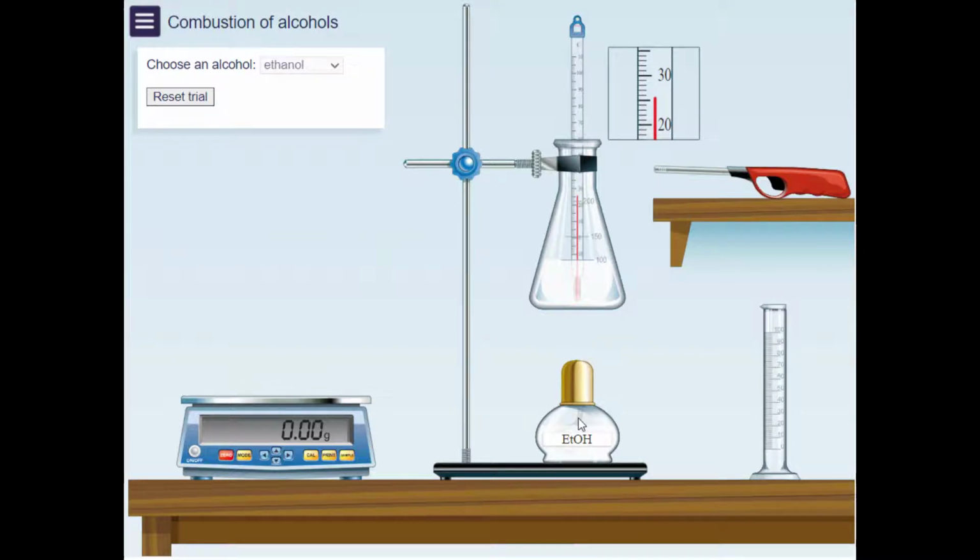Reweigh the alcohol burner with its cap and record the final mass. The weight of the alcohol burner before and after the combustion will provide you with the mass of alcohol burned to heat the water.